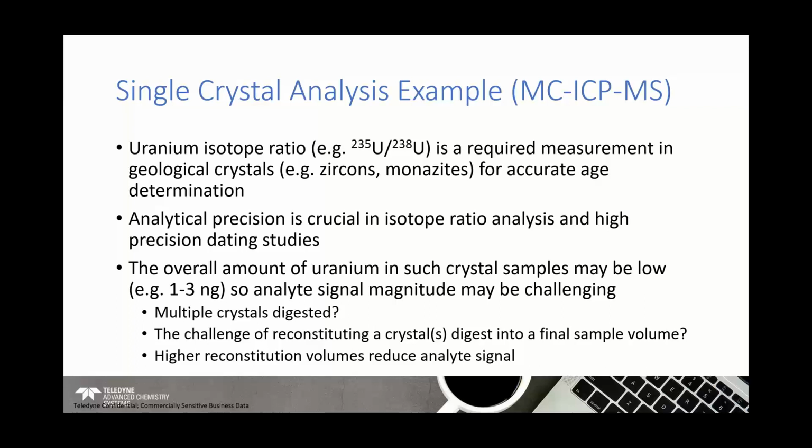The final sample volume we'll come to, but again, there are challenges here with reconstitution, which brings us into sample preparation, which I'll get to next. So higher volumes might start to cause you a problem.